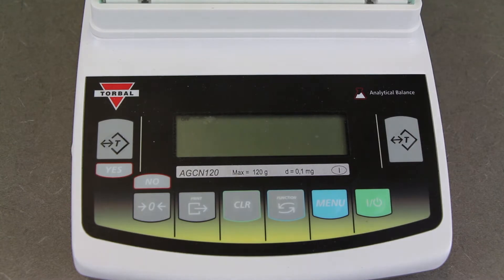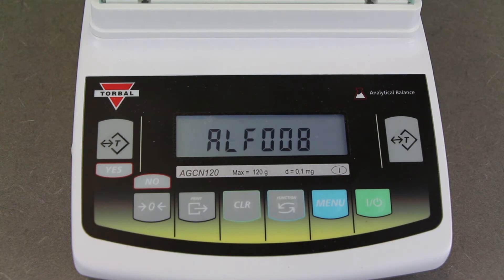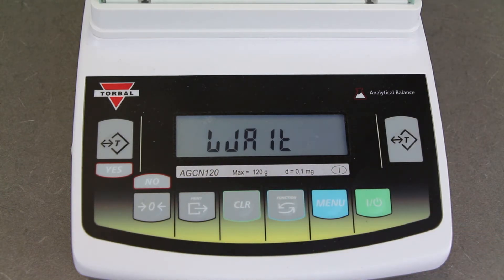Now once the scale has been leveled, you can turn on the device by hitting the on button right here, and that's going to force it to go through a calibration. This calibration process takes usually somewhere around a minute, but it can take several minutes if it's been moved around. You can see that it's now doing the calibration — it displays a funky set of letters that essentially means 'wait.' So it does take a couple of minutes for this to happen, so we'll come back when it's done.